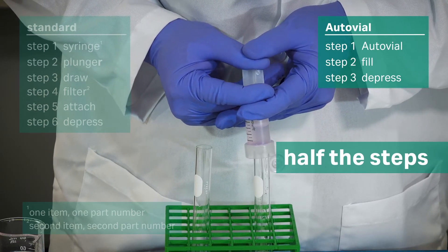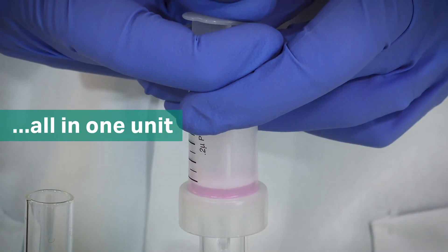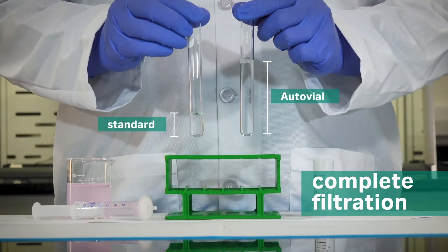Half the steps. A single unit. And did you notice that all the sample was easily filtered to the AutoVial?